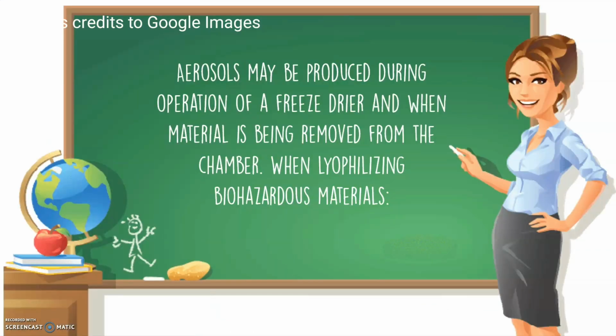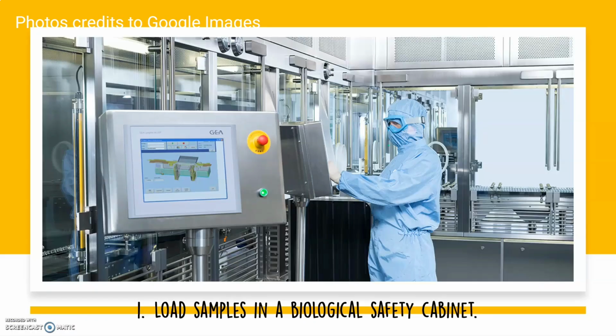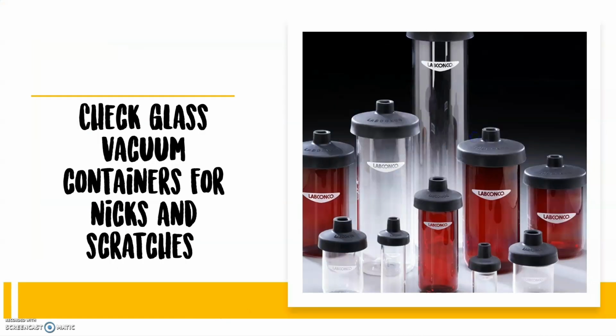Aerosols may be produced during operation of a freeze dryer and when material is being removed from the chamber. When lyophilizing biohazardous materials, first, load the samples in a biological safety cabinet.